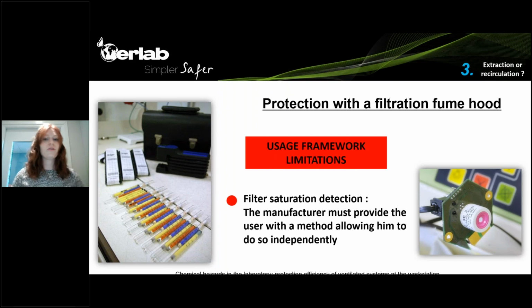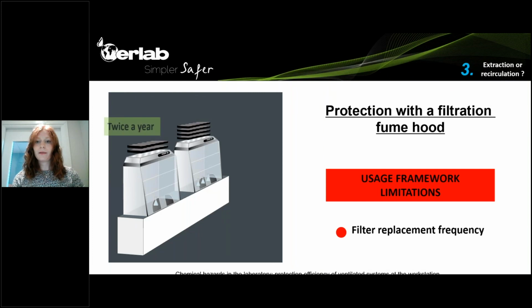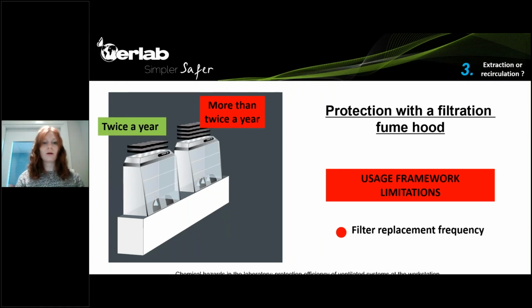All manufacturers of ductless fume hoods should provide the user with a method that will allow them to independently detect the saturation of the filter. And as I was saying a bit previously, there's a filter replacement frequency, which means there's a need for having new filters and changing them.